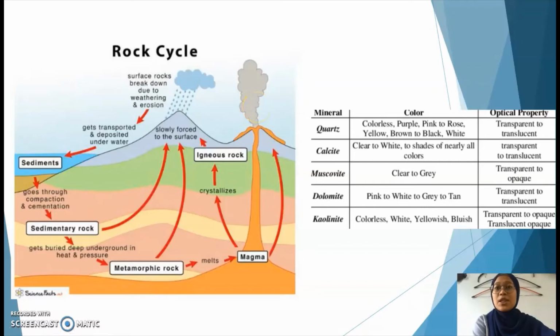presentation of certain features such as the presence of bedding or layering in sedimentary rocks and the presence of mineral foliation or lineation in the metamorphic rock. Then the rock composition is found by determining which minerals make up the rock. The minerals which comprise the rock can be identified using this field testing method, whereby the texture of coarse grain itself can distinguish the individual minerals.